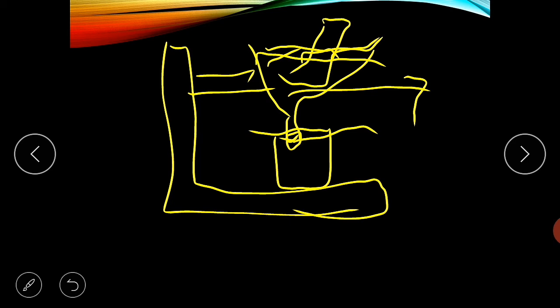Disadvantages: it is more time consuming. Nematodes can lose their activity due to lack of oxygen. Sometimes it may occur. And sedentary and slow moving nematodes cannot be extracted using this method.